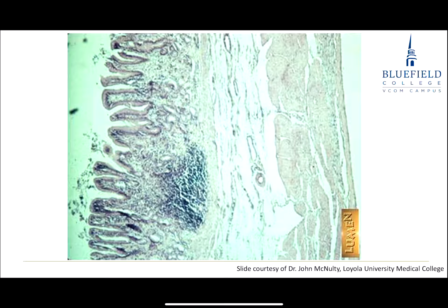So when you say it's pretty close to being a nodule, do you still mean that it's still diffuse? I'm not going to draw that line. Okay, I'm not going to. If I have that here, what is the region encircled? I'm not going to give you both diffuse and nodular on that because it's not real clear. Okay. Previous ones, that's definitely diffuse.